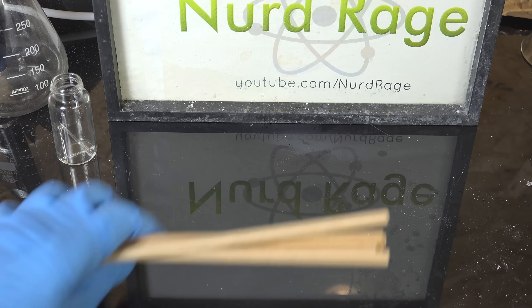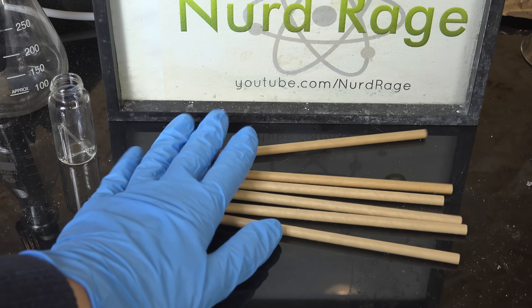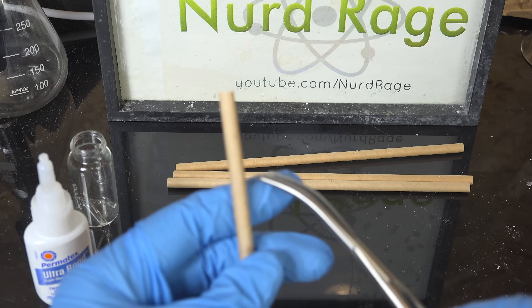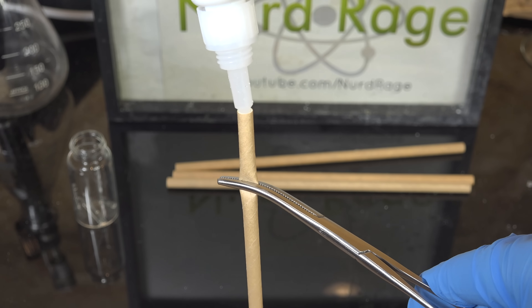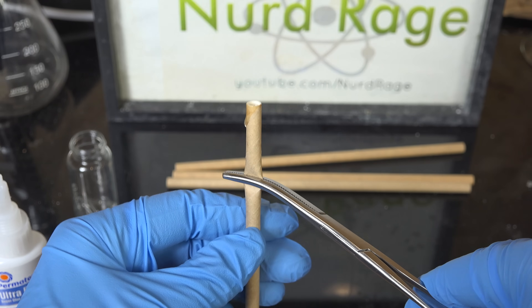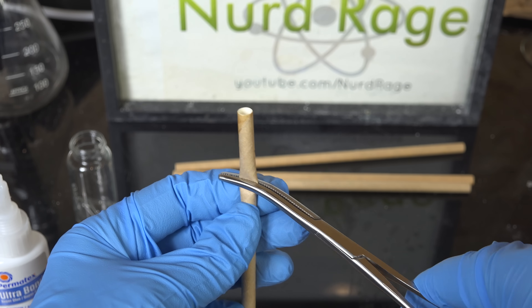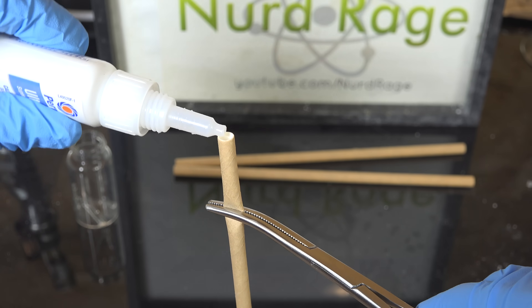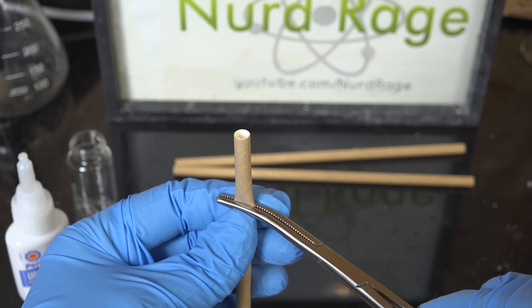First we start with paper straws. These will be the body of our match and should be easy to get now that plastic straws are being replaced. Pinch off a few centimeters of the straw and then add a couple of drops of glue. We want to seal the bottom and create a compartment for the chemicals we'll be adding later. I'm using super glue — cyanoacrylate — so they dry quickly and I don't have to wait too long. Make several straws this way so we have spares. Once you're done, set them aside to dry thoroughly.